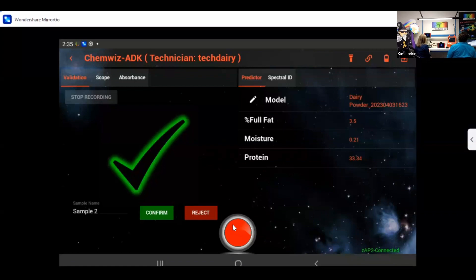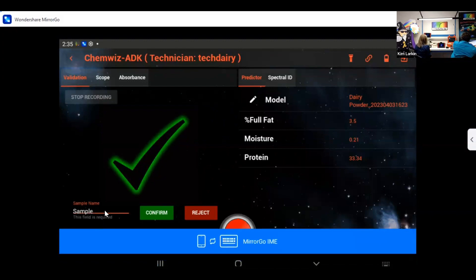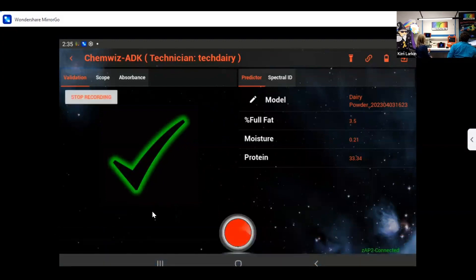You can see we still have a confirmation — low fat and moisture and a high protein. I'm going to go ahead and name that 'dairy 2' and confirm. As a technician, I'm done measuring my samples, so I'll go ahead and stop recording.